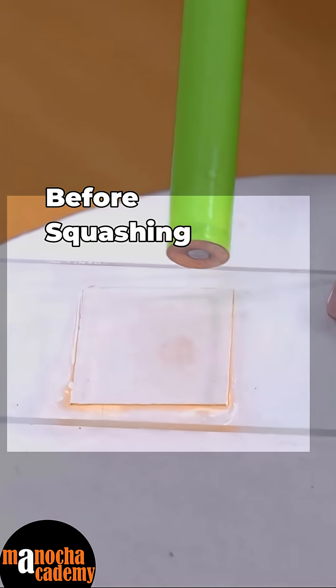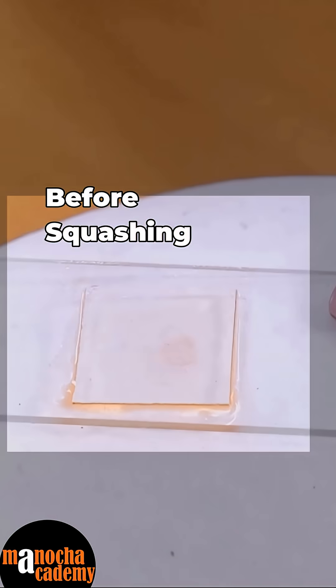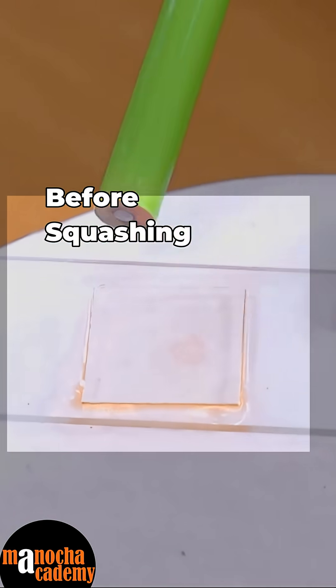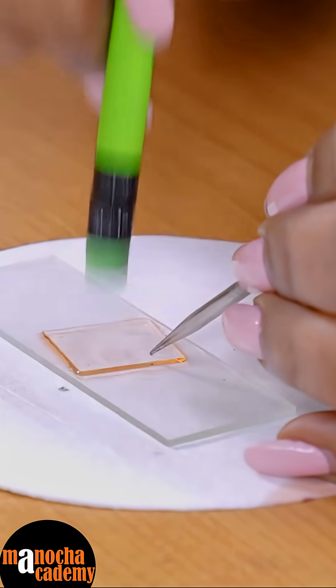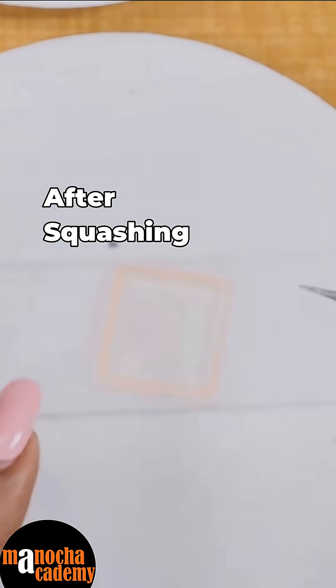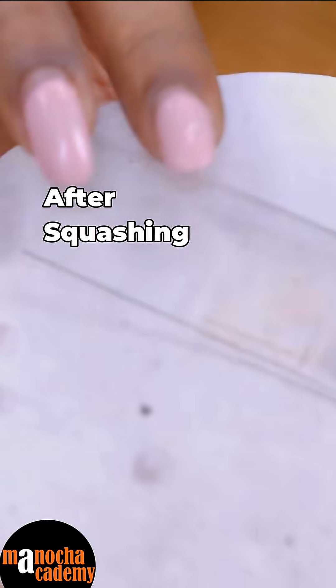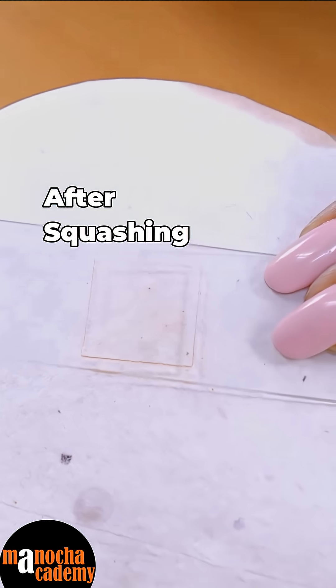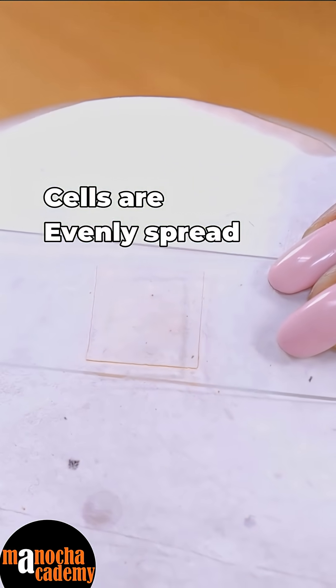Now let me show you something. Before squashing, the tissue looks like a patch or a cluster of cells. Now after squashing, I will quickly squash it for you — just tap it, and after some time you will see that you cannot see the patch anymore. That is when you know that your squashing is complete. After proper squashing, the patch has almost dissolved — that is how it looks after proper squashing.